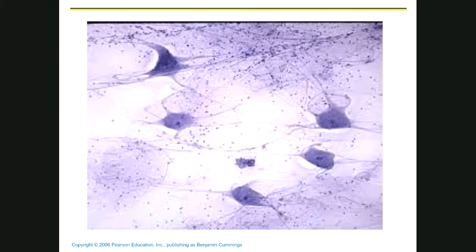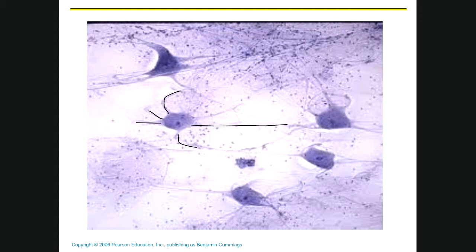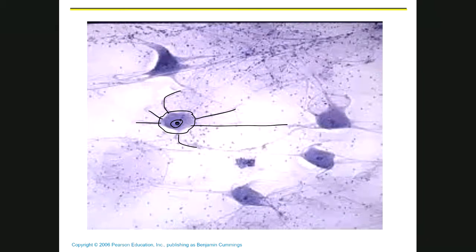If you look at it under a microscope, it's really easy to see these two different types of cells. This one over here has arm-like projections sticking off like this. It has a really big cell body — that's where the cytoplasm is — and then there's the nucleus. If you look at the nucleus of these cells, they look like eyeballs. There you can see another eyeball-looking nucleus.